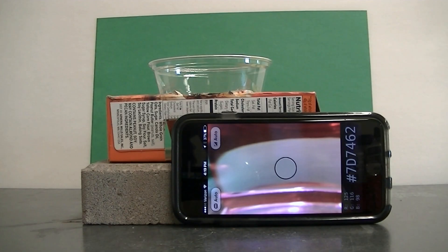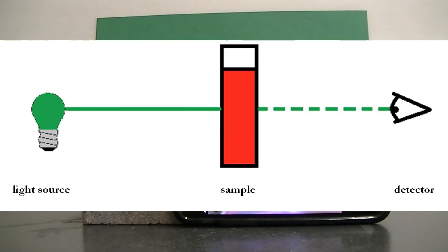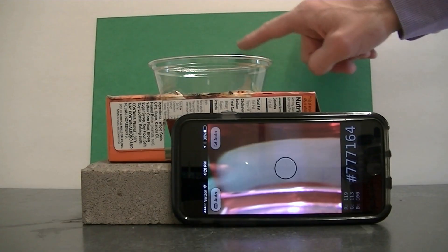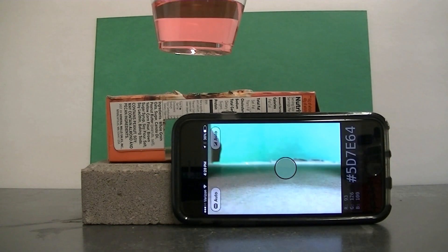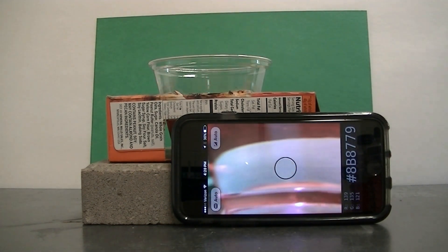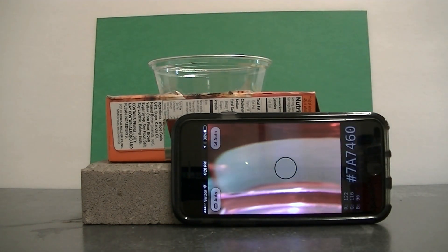Now a spectrophotometer has three basic components. It's got a light source, a sample through which the light passes, and a light detector. And in the setup I have here, I'm using light reflected off of this green construction paper as my light source, my sample is just some Powerade, and my cell phone is being used as a light detector.